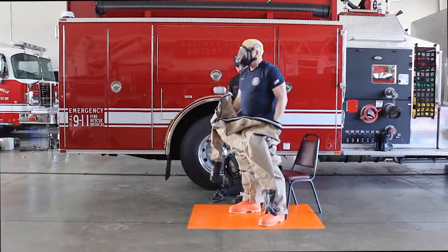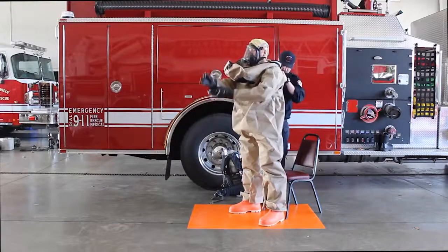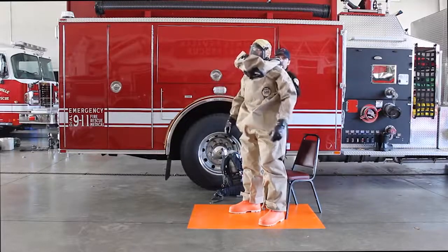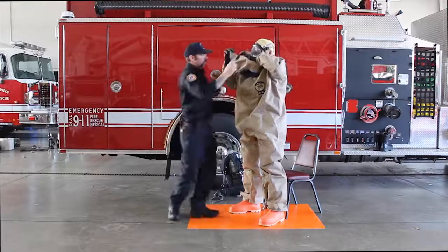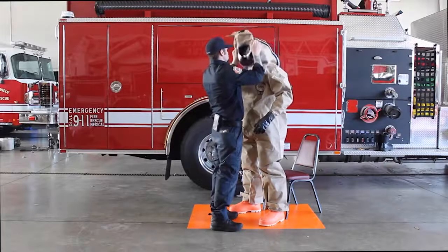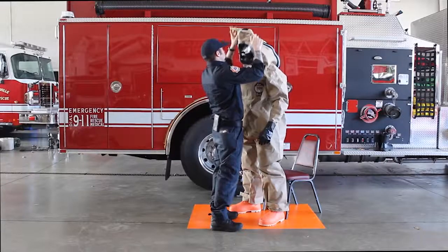Place hands in sleeves and pull garment to shoulders. Pull hood overhead and have assistant ensure proper fit between respirator face piece and garment elastomeric face seal.